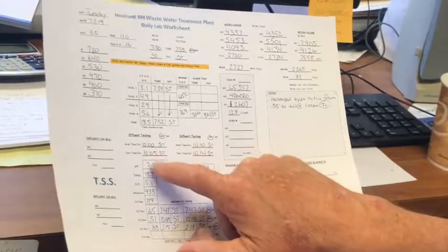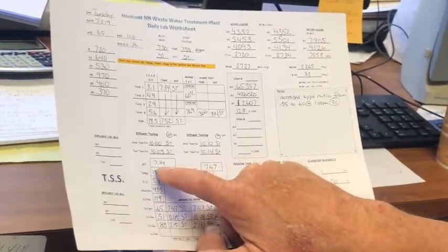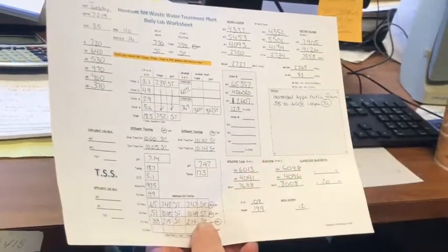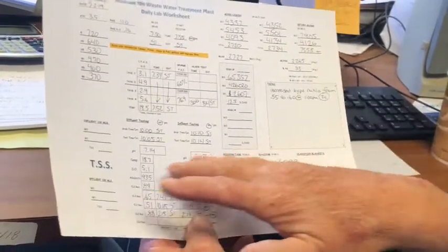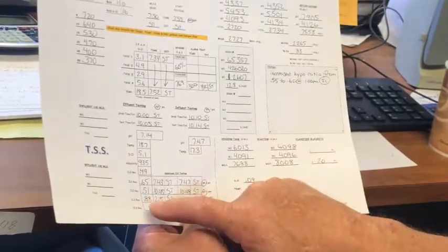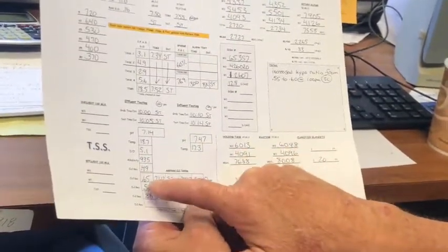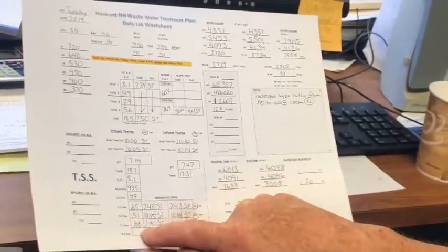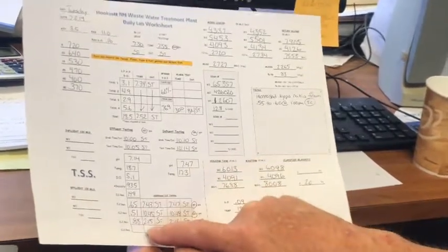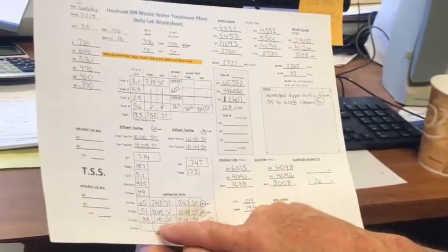We do pH of the effluent, pH of the influent. We do it, which is required, once a day, 7 days a week. We take the temperature, we do the DO going out, we're doing some alkaline testing, and we do chlorine a number of times. We're only required to do it once a day, but we do it more often because it changes.